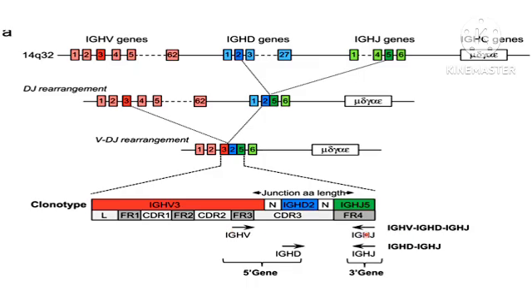Here these arrows represent the primer designing. The forward primer spans the IGHV region, FR3 region, and IGHJ, and the reverse primer spans the FR4 region. So if you target here, you will get IGHV, IGHD, IGHJ sequence. If you design primers from here in between, a forward primer spanning part of the CDR3 region and a reverse primer spanning the FR4 region here, it will give you a sequence comprising IGHD and IGHJ.